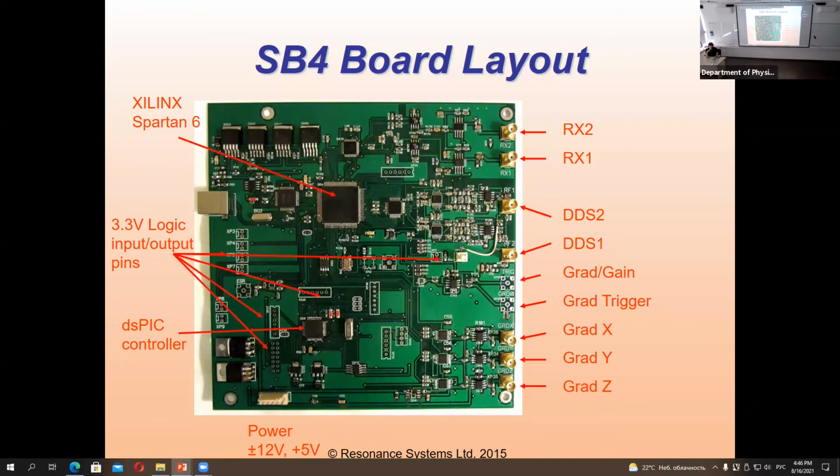So what typical losses does your device introduce? We are not using this type of solution. We are using just filters, low pass filters, and these involve crossed diodes. If you are working with a strong signal, these diodes act as a short, and then you get a parallel circuit that gives really huge impedance, and the signal doesn't go through.